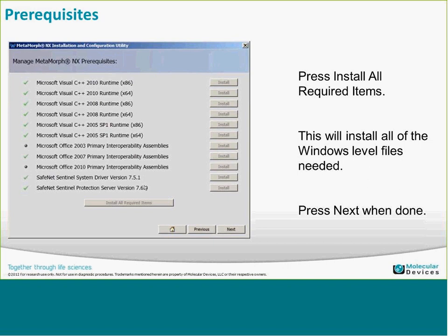Click Next when done. Typically with the Sentinel system driver there will be a reboot in between — after it finishes installing you'll have to reboot the system, then you can start again.